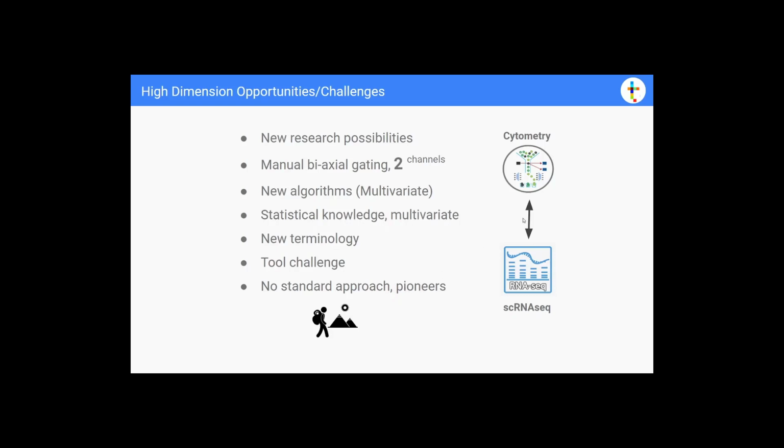So I have to mention that cytometry and single-cell RNA-seq are feeding off each other, because single-cell RNA-seq also deals with similar dimension issues as cytometry, and what's happening is an interesting synergy between the technologies.